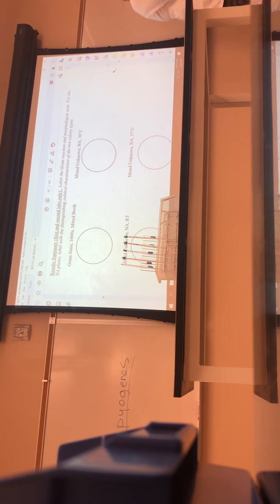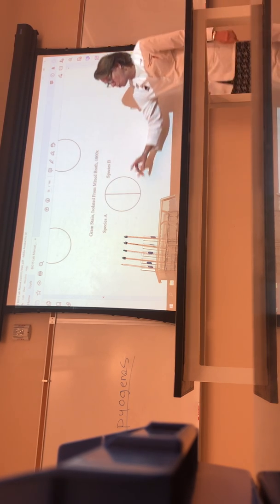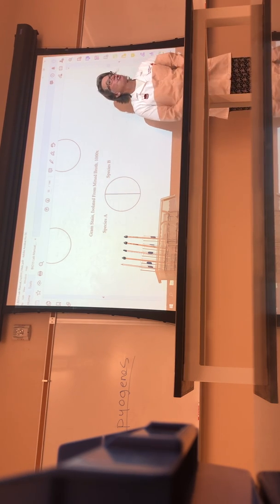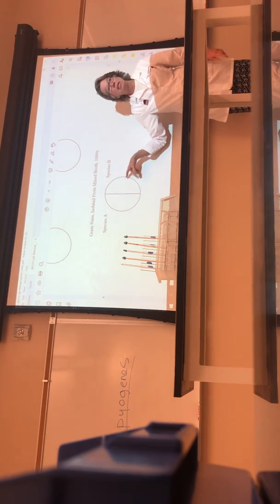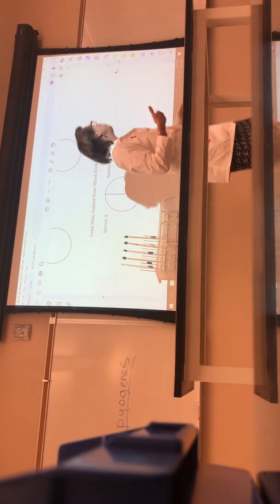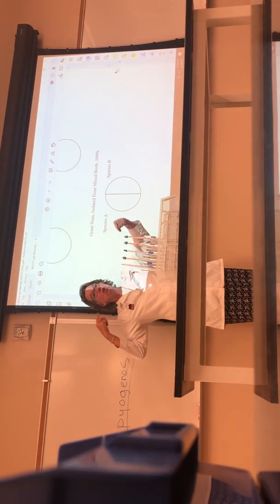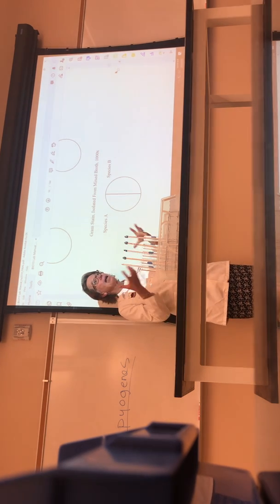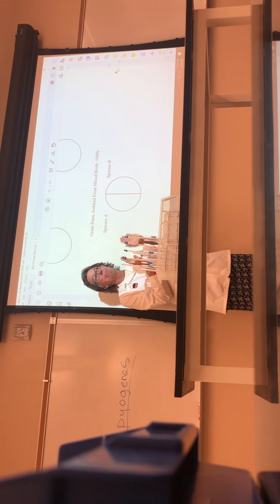And then, remember, what you did was, hopefully, and I see it for most of you, you should have tried to do a gram stain of those 2 species, okay? Species type A, a gram stain, species type B, a gram stain. So you could start to get an idea that, oh, that big white furry one is a gram positive rod, for example.